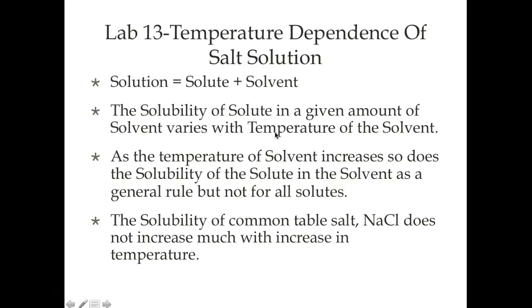And then as you vary the temperature, you will also study how much of sodium chloride can dissolve in 100 grams of water, keeping that water amount constant, to see how much of this sodium chloride can dissolve as you increase the temperature. Typically, as you increase the temperature, more of the solute should be able to dissolve in that same fixed volume of water, or a fixed mass of water, as in this case the solvent is water. So as the temperature of the solvent increases, the solubility also must increase. You're able to dissolve more of that solute into that same amount of water, as a general rule.